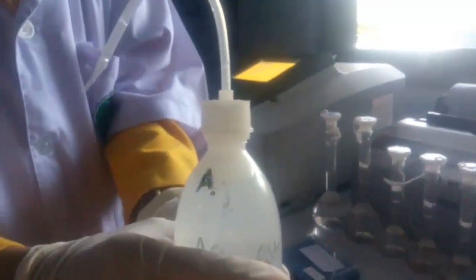Sample of chloramphenicol. 8 ppm standard of chloramphenicol, 12 ppm standard of chloramphenicol, 16 ppm standard of chloramphenicol, 20 ppm standard of chloramphenicol, 24 ppm standard of chloramphenicol, aquadest.